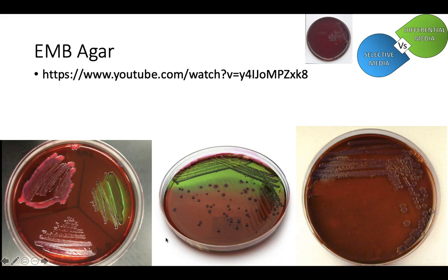Now, in this case, there is no pH indicator. So how are you going to tell if you can make acids or bases? Kind of interesting. So if you can eat lactose, you are going to ferment your lactose. You're going to produce an acid. That acid is going to be released outside of the cells, which will then diffuse into the agar. Now, what acid does when it comes in contact with bacterial cell walls is regardless of what type of agar it is. The other agars just don't have the types of dye that will work this way inside of them, or else they would do this, but they don't.